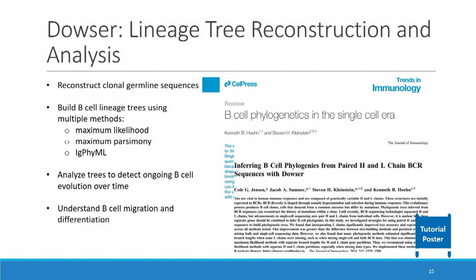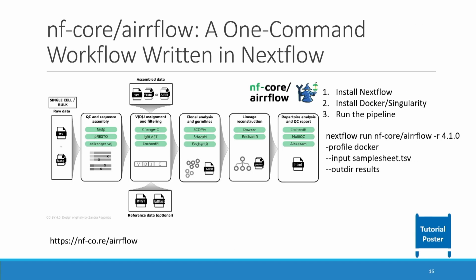And this allows you to take clones and reconstruct lineage trees using multiple methods like maximum likelihood and maximum parsimony. I urge you, there's a tutorial where I think there's maybe 2 or 3 spots left this afternoon. If you're interested in lineage trees, please do sign up for that tutorial.